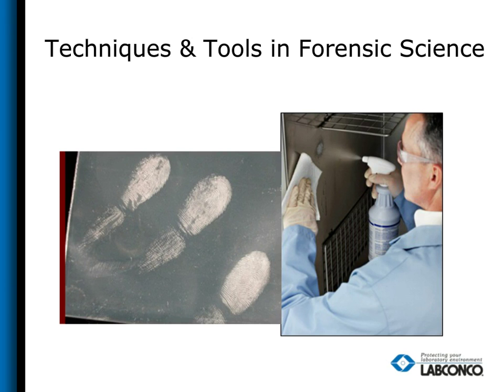Another thing with the CA fuming process and your CA chambers is cleanliness. The cyanoacrylate works with a polymerization onto the fingerprint surface. Once that polymerization starts, it will keep on building onto itself. So if you have fingerprints, things where you touched the glass or the interior of the chamber, you'll start developing those before you start developing the fingerprints on the evidence. So it's important that you always work with a clean work area that's easy to clean and free of foreign material.